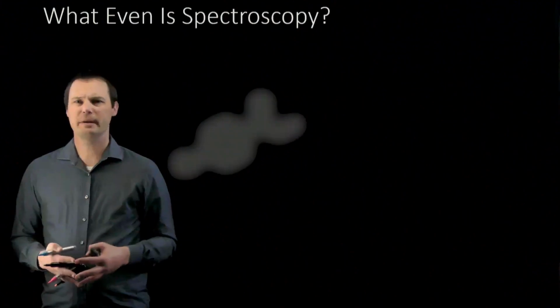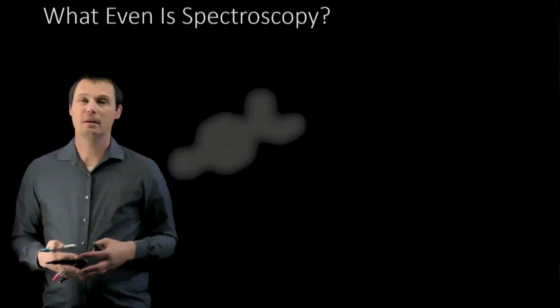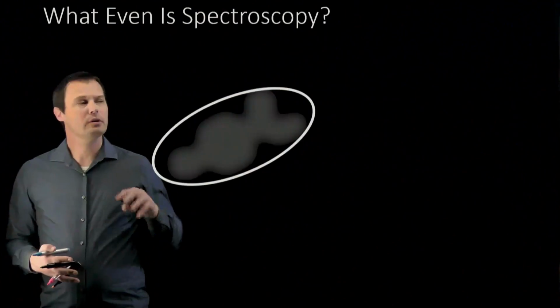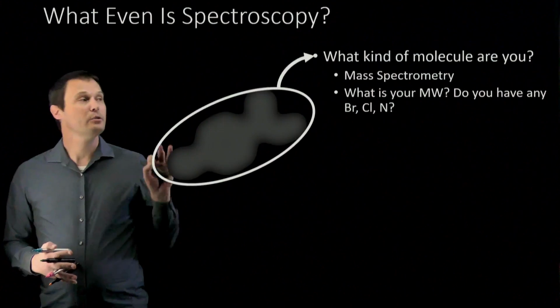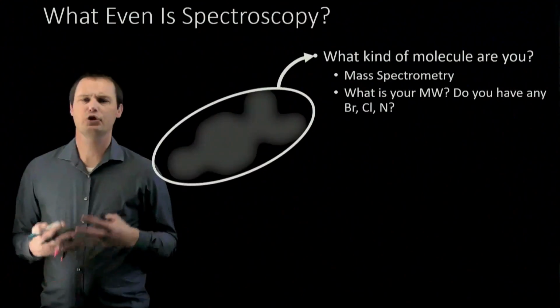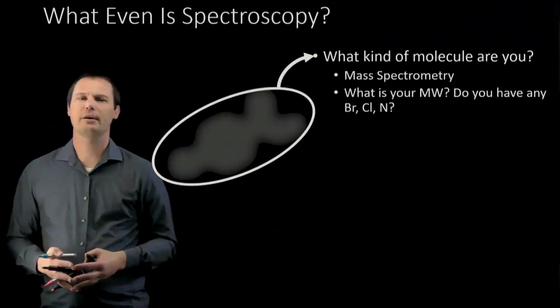So what are some of these spectroscopic tools, and what questions do they ask of molecules, and what answers do they give us? If we have just a generic molecule, it really doesn't matter what molecule this is. Here are some of the questions that we might want to ask. We might want to look at the molecule as a whole and ask some questions of the whole molecule. So we might want to use mass spectrometry to ask, what kind of molecule are you? What is your molecular mass? Do you have any atoms like bromine or chlorine or nitrogen? We're asking questions about the entire molecule.